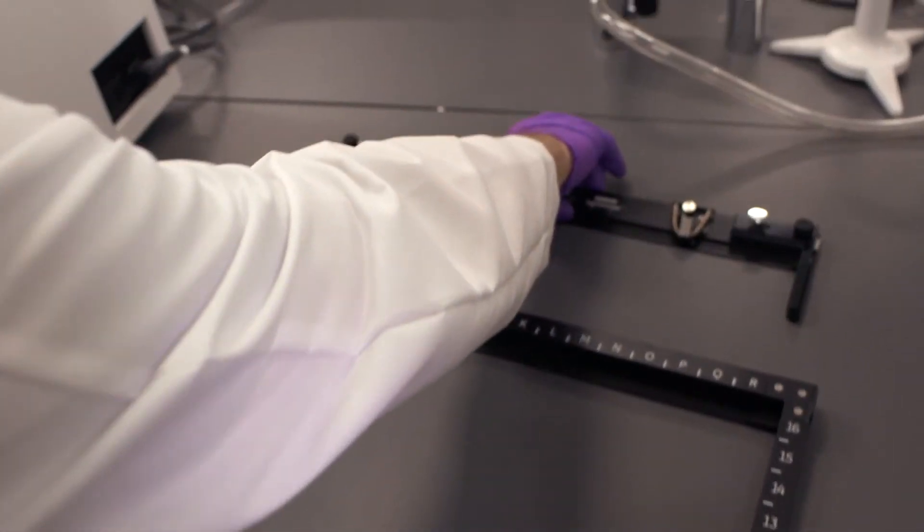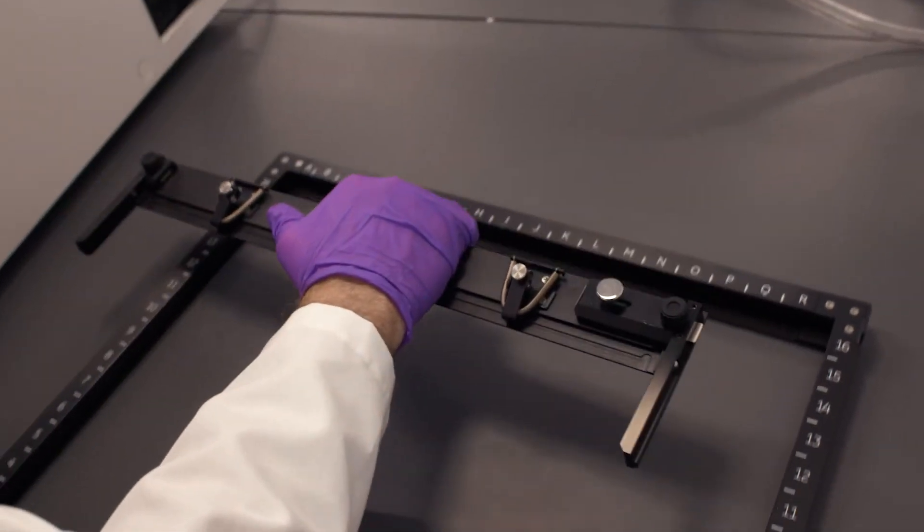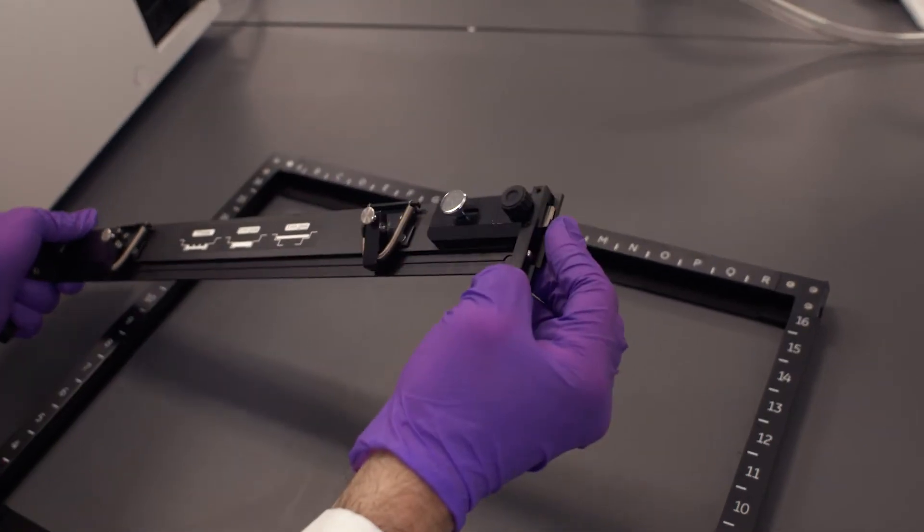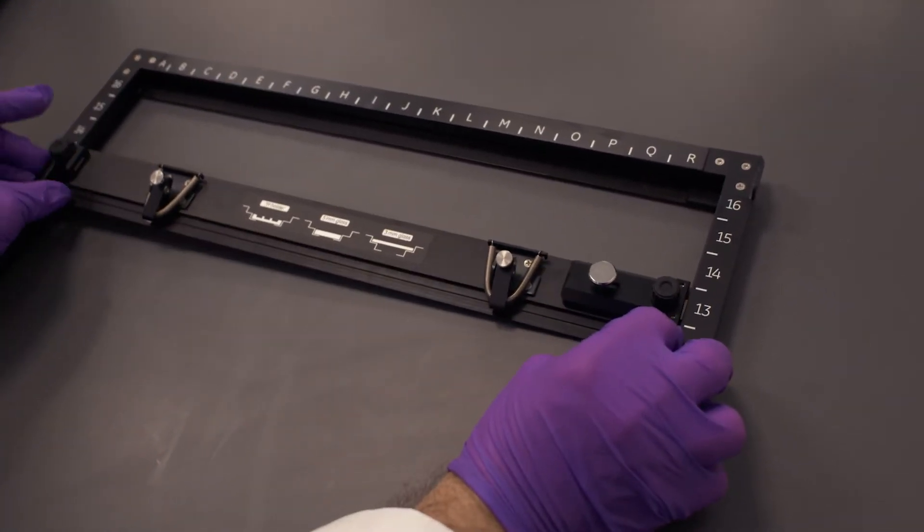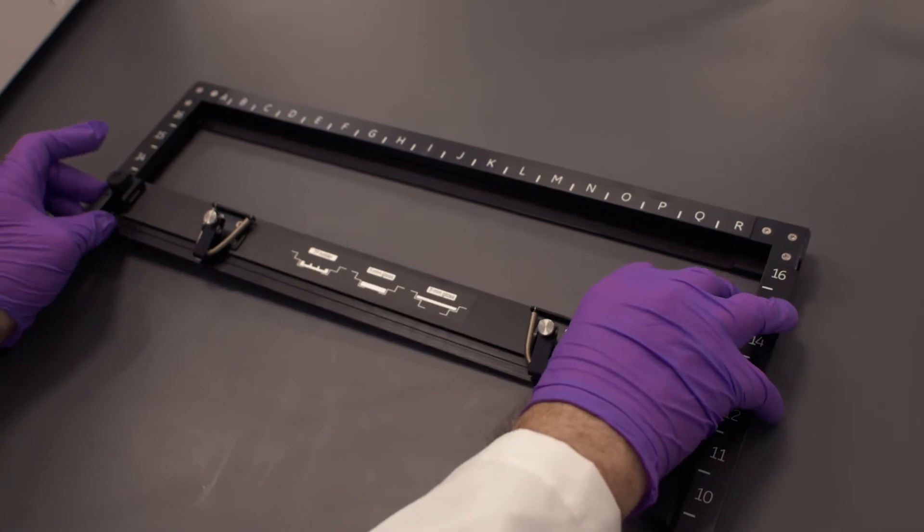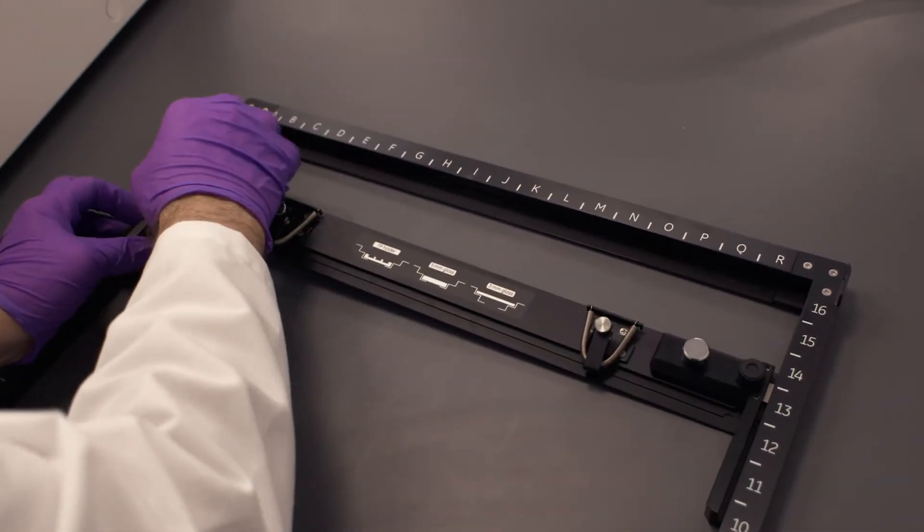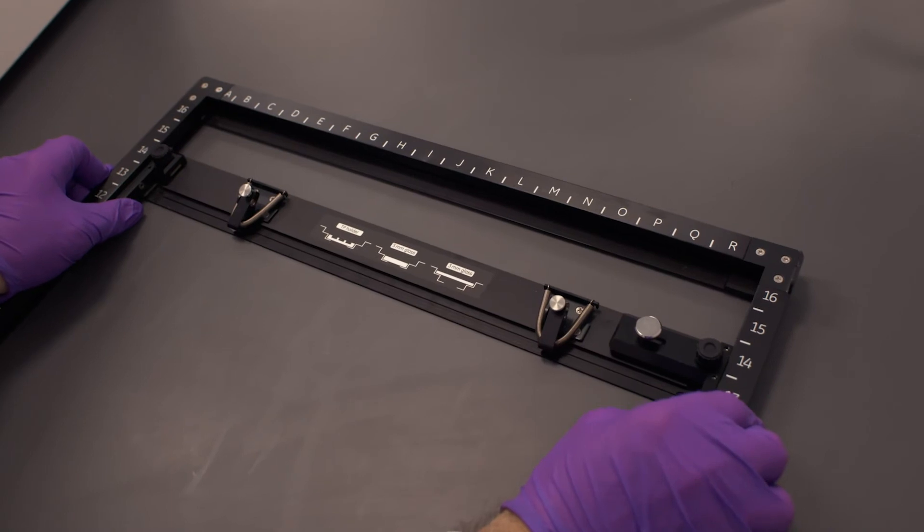We're going to do the same for the top bracket here. This will go in a little bit easier. You'll see on the side here we have a little lip. That will slide in there, and then just push it in a little bit.